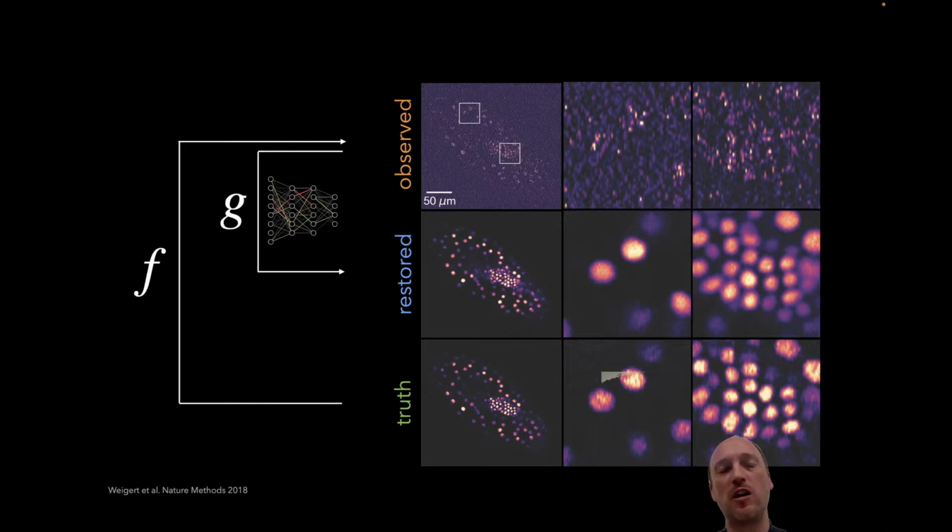Because we know really, really well the kind of images we expect to find, we can really powerfully triangulate in some sense the true images that we really want from very information poor observations, right? So that's very powerful. That's also risky because, of course, there's a lot of imputation happening, right? And so you have to also make sure that your assumptions are correct here. The training data has to really fit what you apply the training models on, and so on. But it's been extremely successful overall.